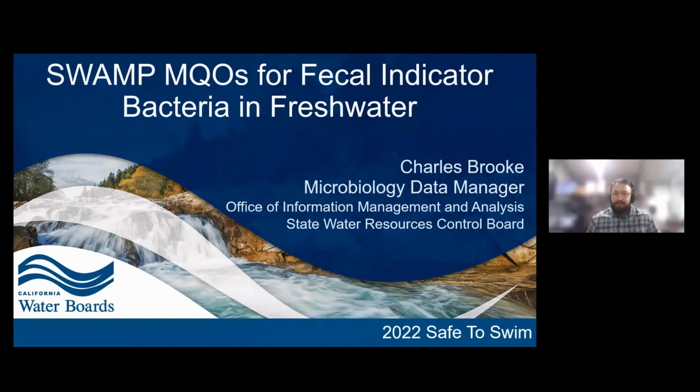Today, I'm going to walk us through the SWAMP MQOs, the measurement quality objectives that we use in SWAMP to ensure that data quality is standard and sufficient to be released to the public, and we can all get along with our data, analyze things on an equal footing. And then I'm going to also look at the recent changes that we've made to the SWAMP MQOs and why that was.